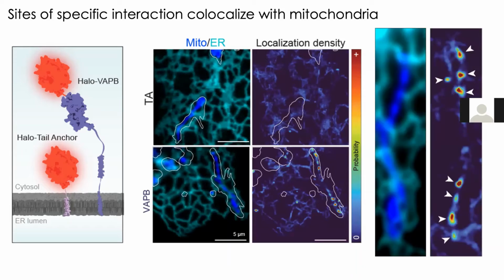In fact, it's sufficiently correlated that you can see that during the time of a very short movie, in this case 1 minute, every place that these two organelles touched one another, you get a transient hotspot in tether behavior as the individual molecular tethers rush into the space and try to stabilize the interaction as it forms.